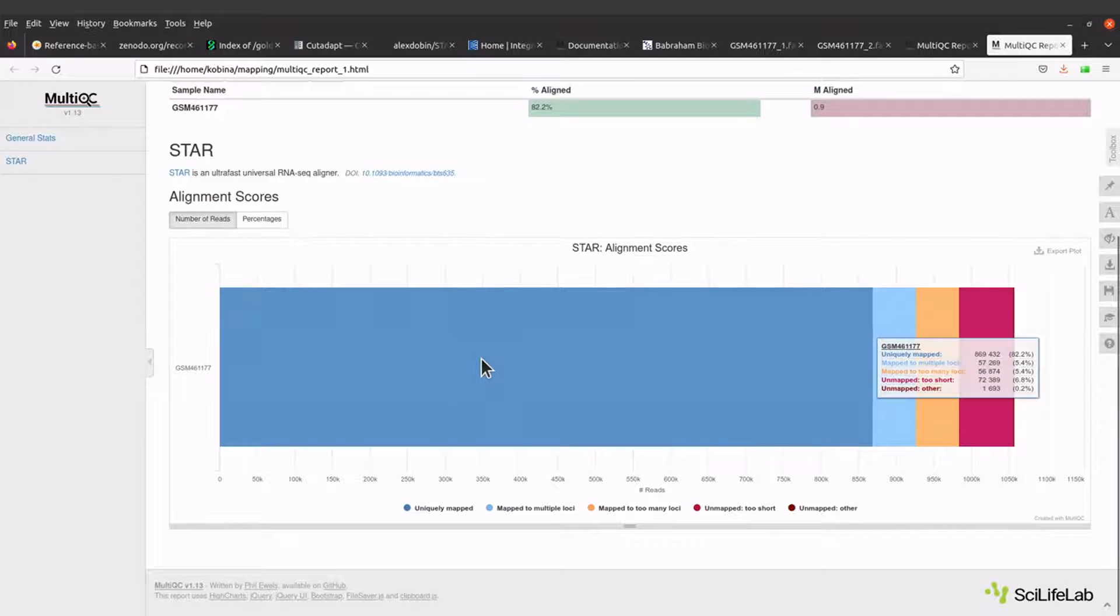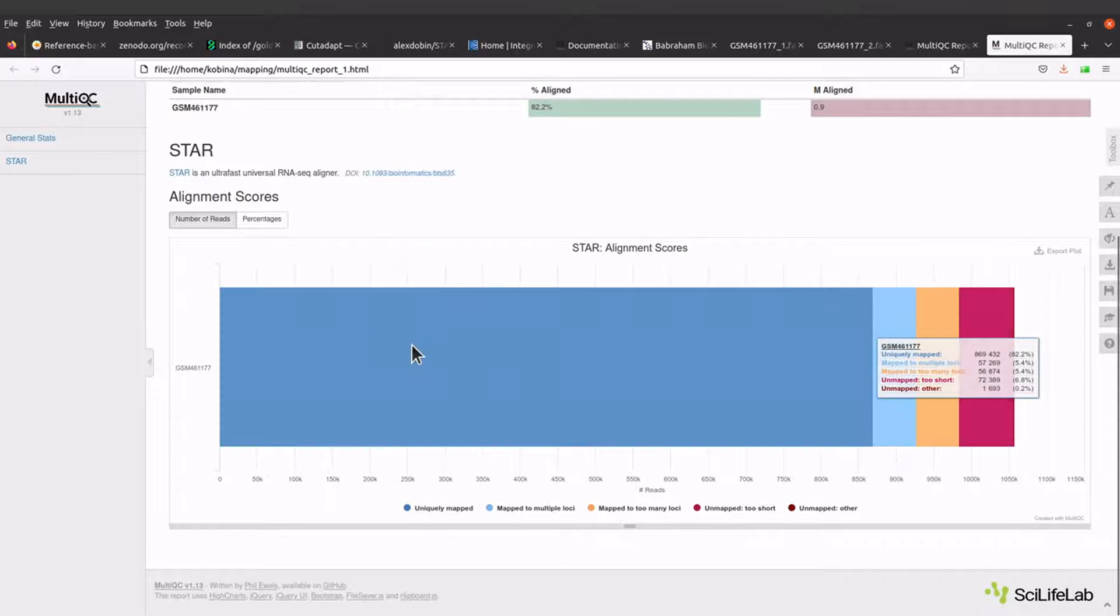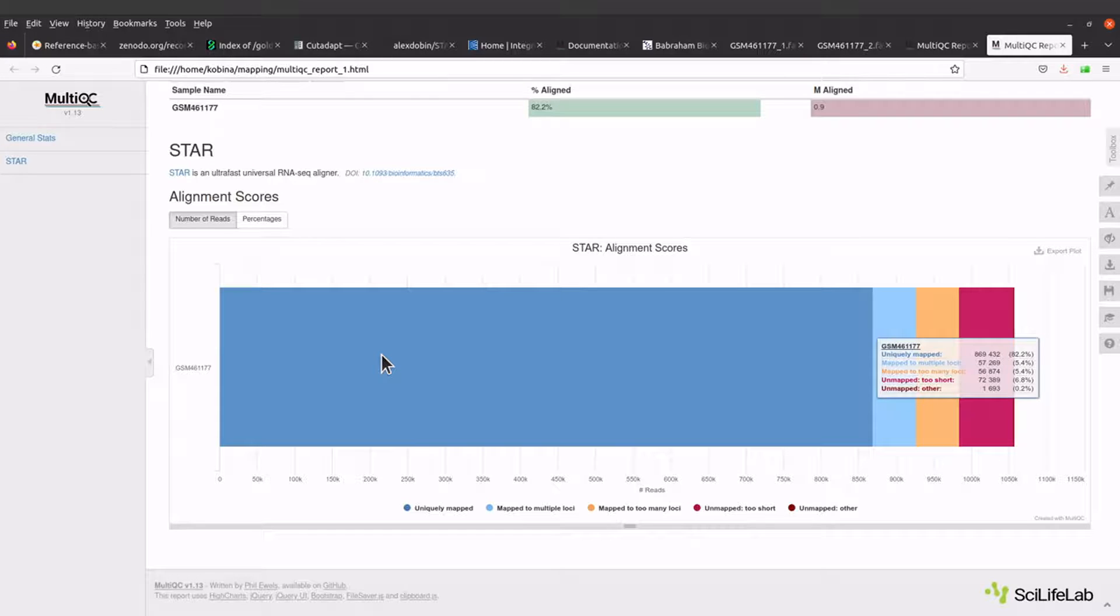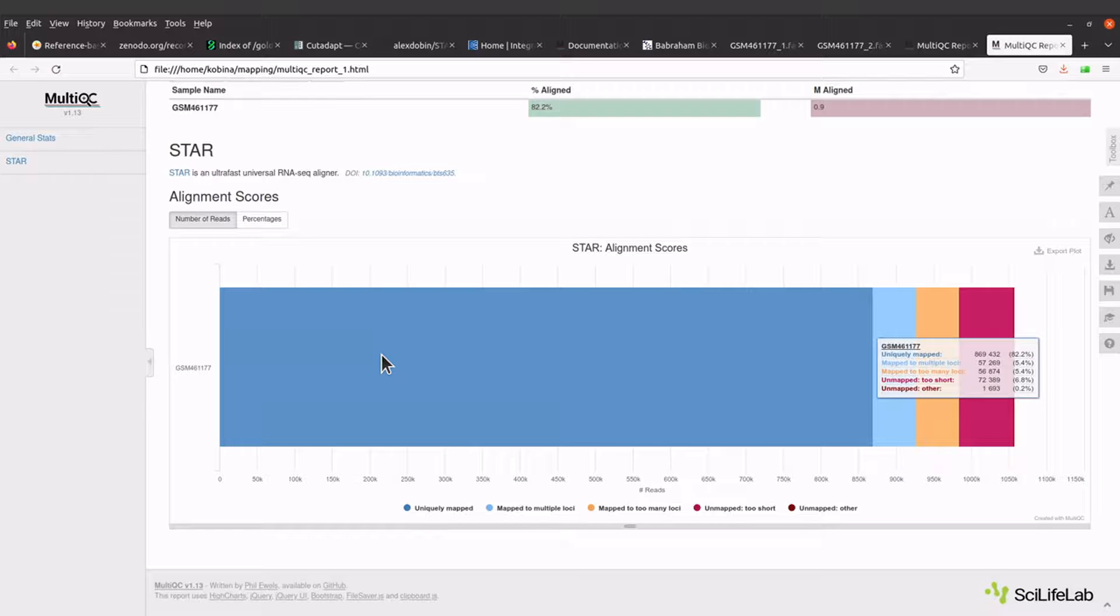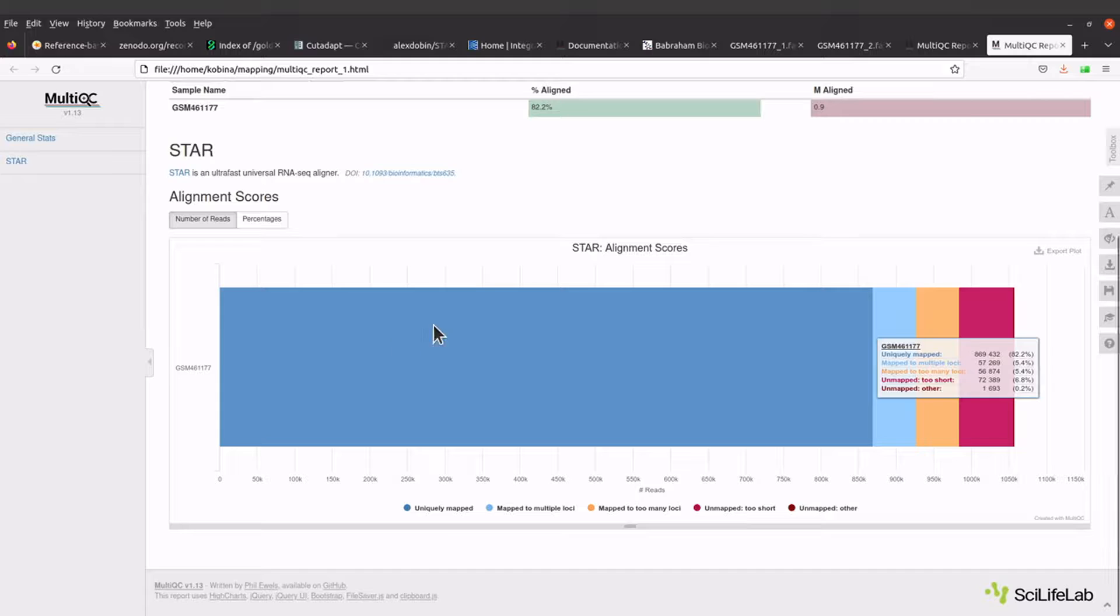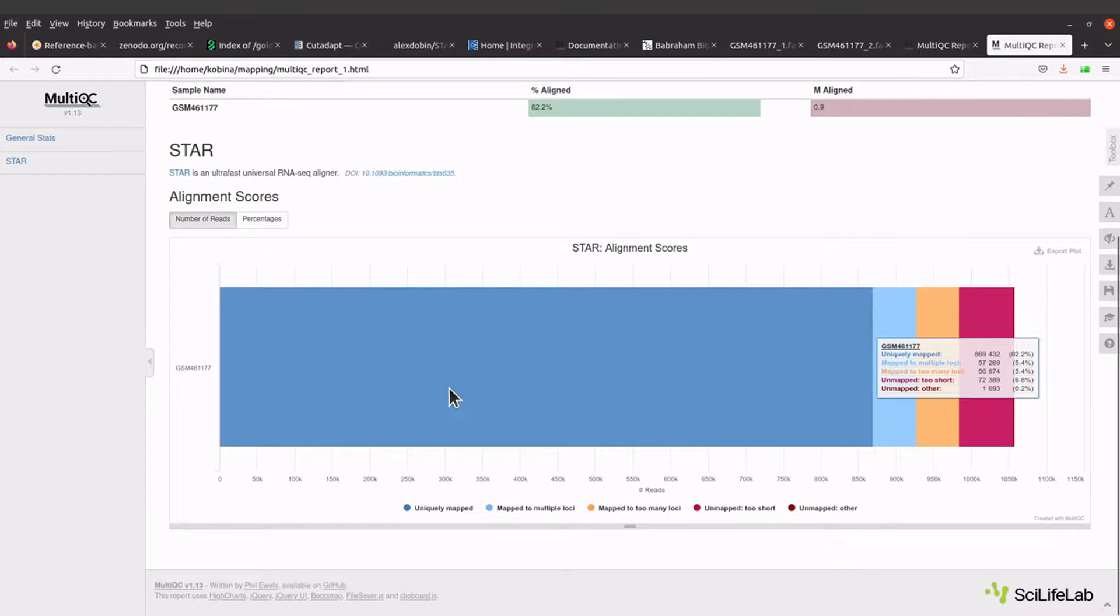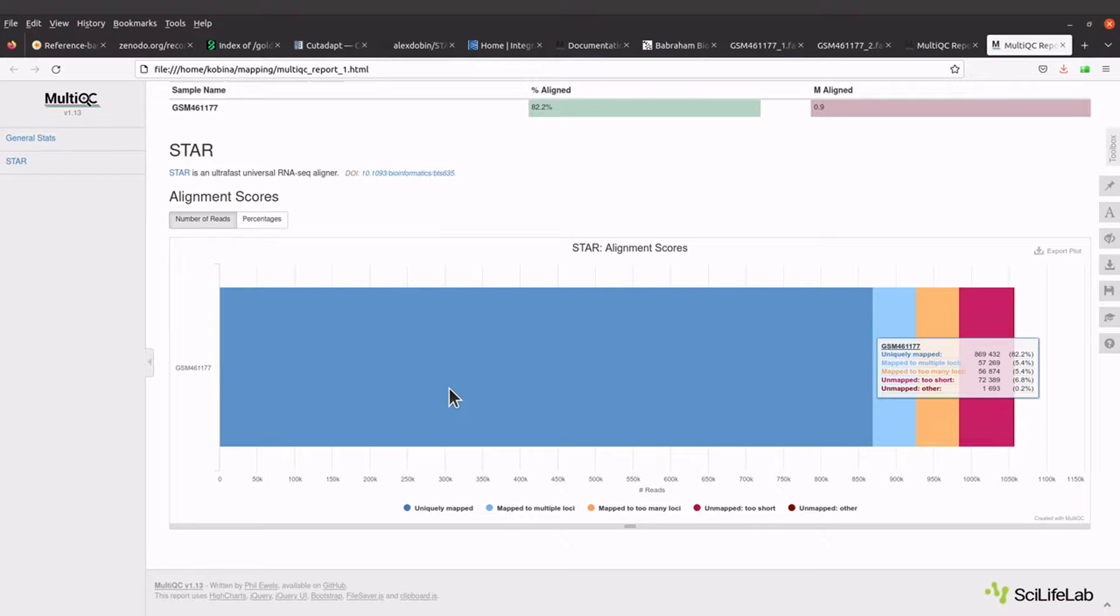So one cool thing about MultiQC is that it's able to aggregate reports. It's useful especially in situations where you have lots of samples. It can be cumbersome trying to open the reports for each sample, but if you aggregate all of them into a single document then it's easy to look at them and then also do your comparison. So MultiQC is a cool tool for doing that. That's about it.